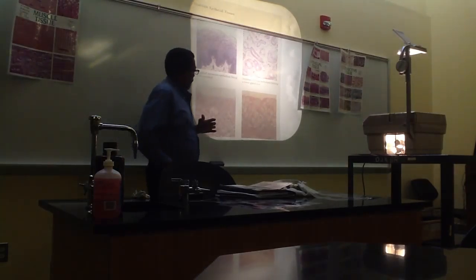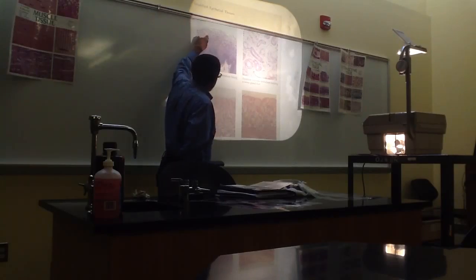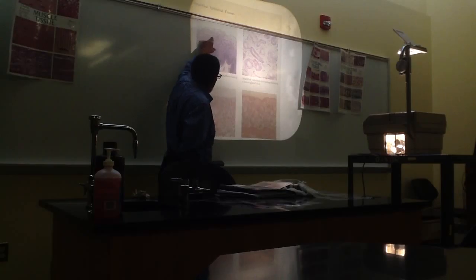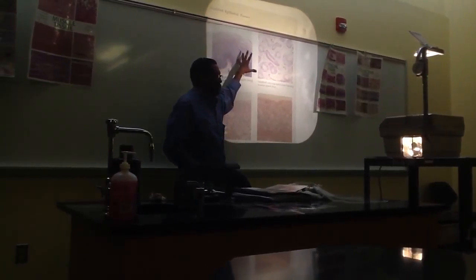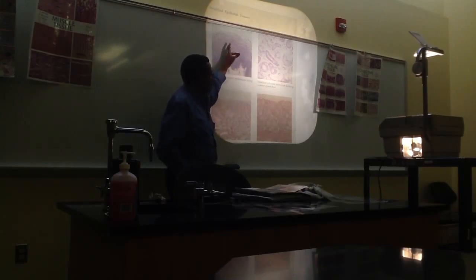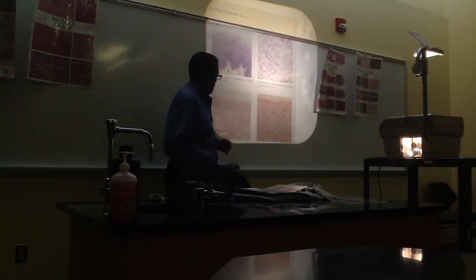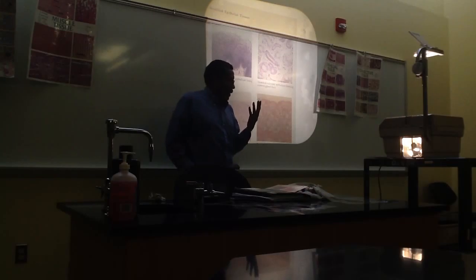Okay? And you won't see very clearly defined cell membranes in all cases. But in the case of epithelial tissues, the shape of the nucleus is what's going to suggest the shape of the overall cell.